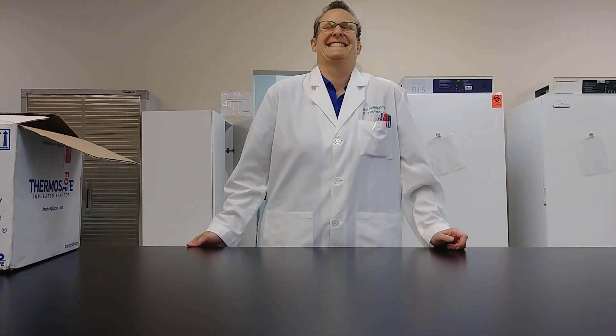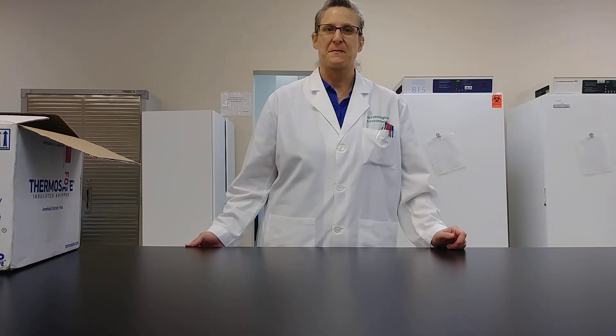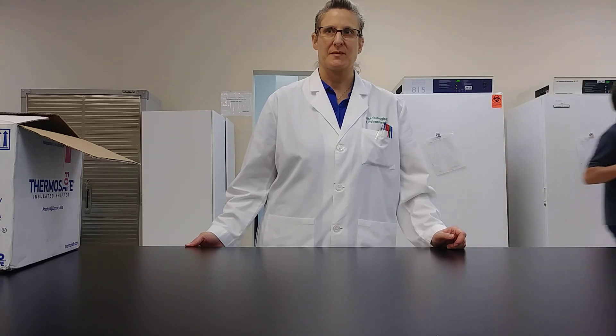Welcome to Focus Labs. Today we'll be showing you an instructional video on how to take compressed air samples.